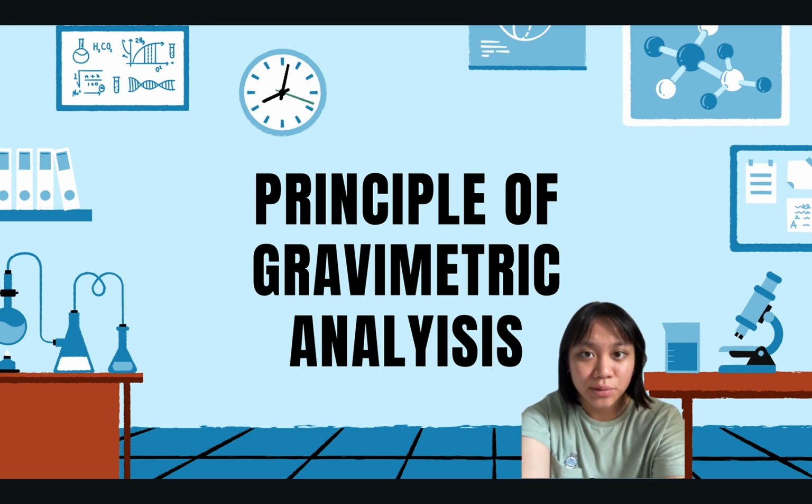Okay, so the next one is the principle of gravimetric analysis. The principle behind gravimetric analysis is that the mass of an ion in a pure compound can be determined. Later, it is used to find the mass percent of the same ion in a known quantity of an impure compound.